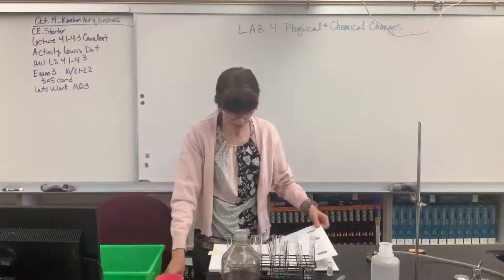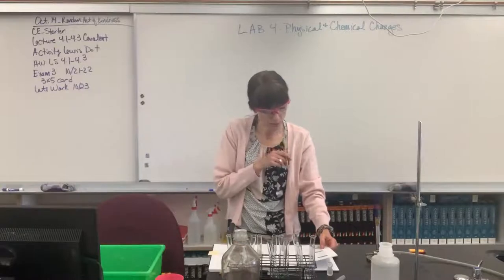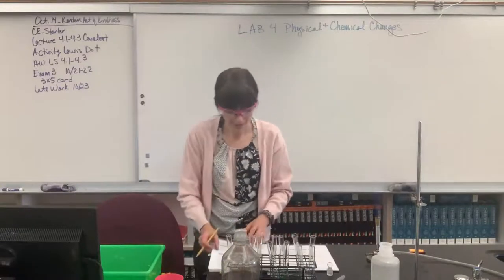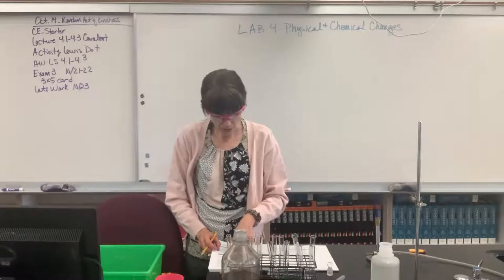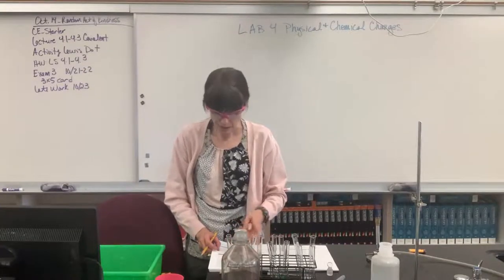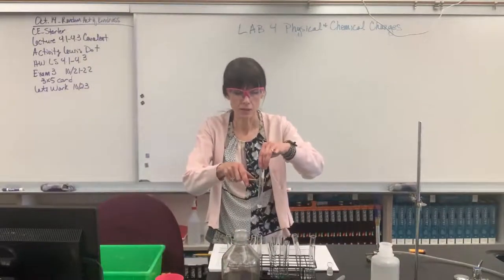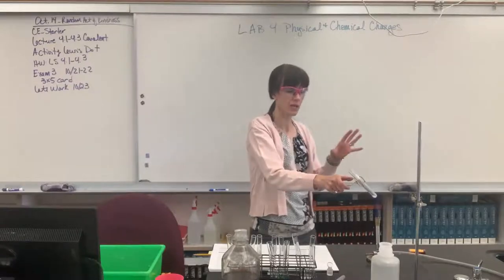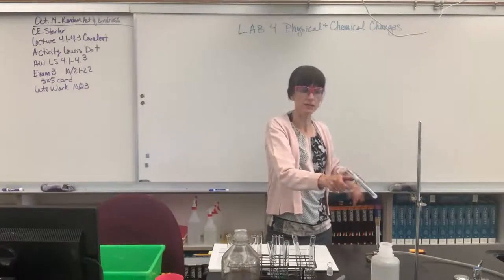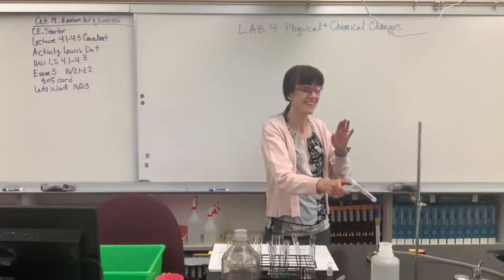So we will come back to page 54 and let's see, color of recovered solid. But you know, maybe we're not writing that down. Let's wait on that. Come back to number 5. It says, evaporate the resulting solution from step 4 and recover the solid by the method described in step 6 of part A. So it just wants me to heat this up, drive off all the liquid, and see what's left over. So we're going to heat it up, evaporate any liquid that's in it, starting to boil. I'm hoping you can hear that as it's boiling.